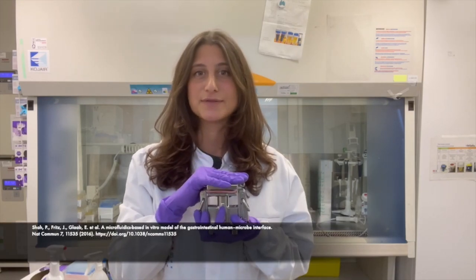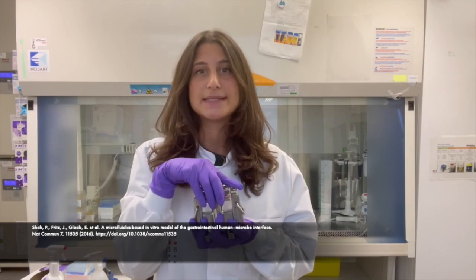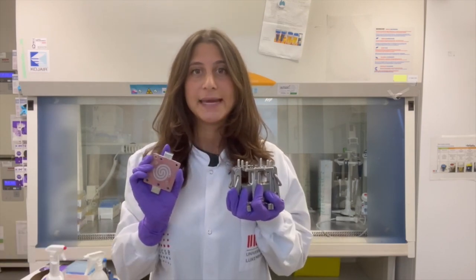Hi, my name is Mara and I am a PhD student in the Vilmes lab. My work aims to study gut microbiome interactions and to investigate how gut microbes can influence drug metabolism processes. For this, I use a gut on a chip that we call Humix which stands for Human Microbial Cross-Tog. Humix is modular which means that it can be opened up after each experiment in order to extract the supernatants of the cells and bacteria and to analyze which proteins they express.